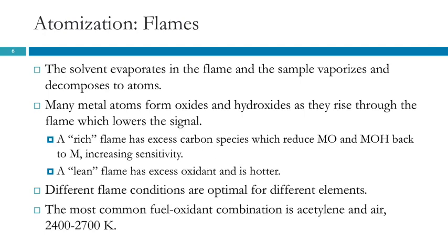The most common fuel-oxidant combination is acetylene and air, and that'll give you temperatures of about 2400 to 2700 Kelvin. So that's nice and hot. Any questions?